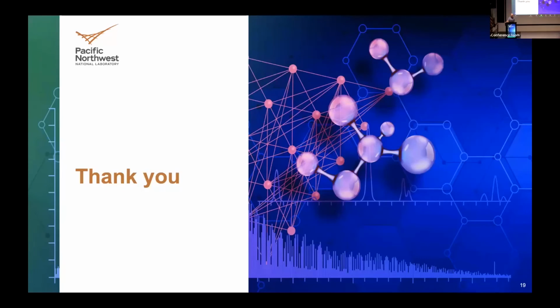My question will be about the data input, because I think it's where everything works. If you don't have a good input, you don't have good input data. So how do you define your input data? Let's say I have no idea about your MS data, and I just want to use my own data with your program. How am I going to define my input data? How will my input data look?